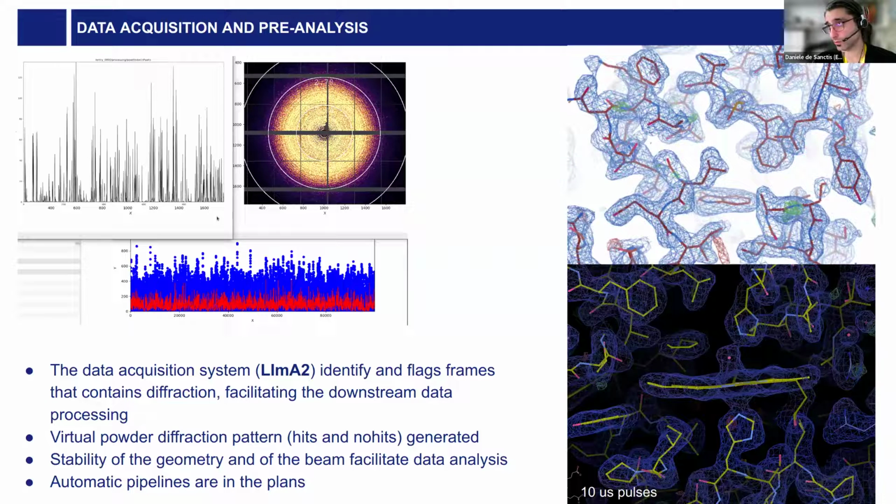Also, in this way, we can work at higher concentration of the ligand. And given the fact that diffusion in the microcrystal is more effective, we can screen different concentrations much quicker.